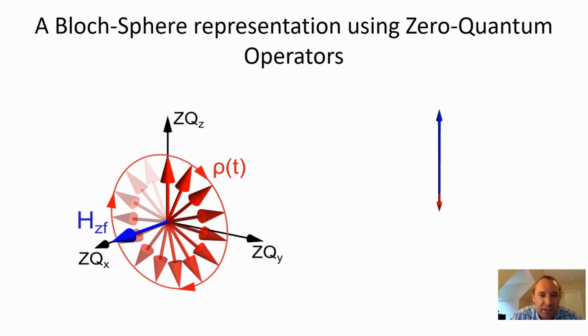Let's compare the video that I showed you first with this picture of zero quantum Z starting to rotate. So the beginning, I said, is carbon pointing down, proton pointing up in the video. Let's run it one more time. This thing starts rotating, okay? And in the middle, you see there's a point where there's no magnetization, where they both kind of cancel each other out.